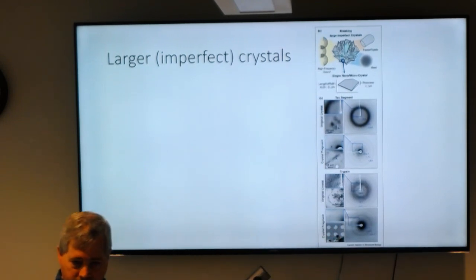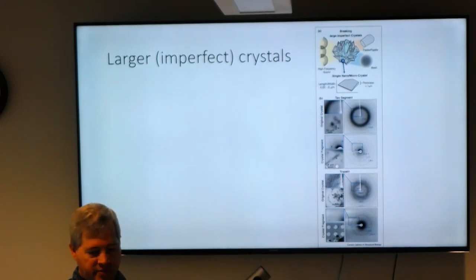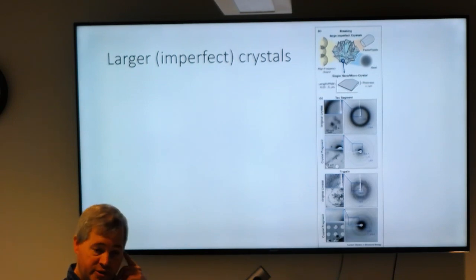And like holder, can we just use a standard holder? Yeah, standard holder. For the powders we've just been doing it on the room temperature holder. But you could do a cryo holder too if you wanted to do it at cryo temperature, or if you're on something with an autoloader, then there's no problem at all. But you'd have to make sure your goniometer is good. When you're doing this continuous rotation, if the goniometer is not well aligned, like if the tilt axis is off the optical axis, then when you tilt it, it will appear to move, and if it moves out of your imaging, then it won't work. So your goniometer should be good.